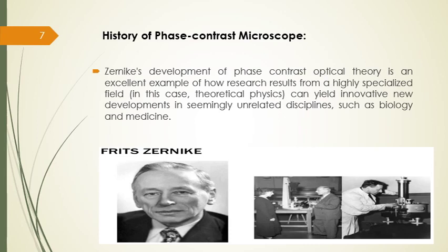This phase contrast technique proved to be such an advancement in microscopy that Zernike was awarded a Nobel Prize in 1953. Initially, Germany was the first manufacturer to incorporate practical phase contrast optics into their microscopes. After convincing and extensive experiments with the Zernike method, the immediate impact on biological research was significant. The application of this technique continues to the present day.